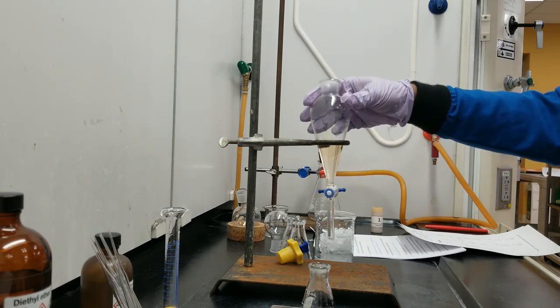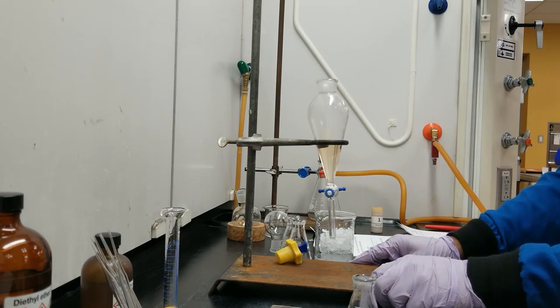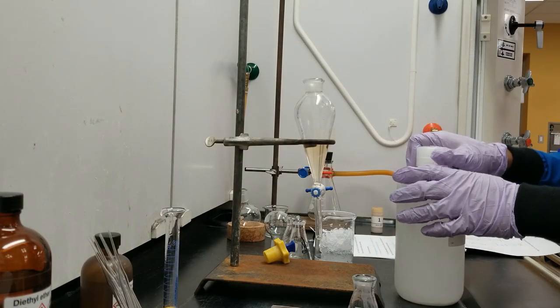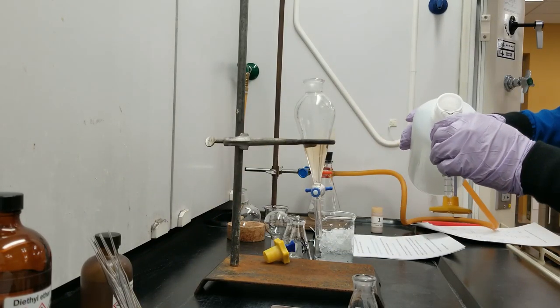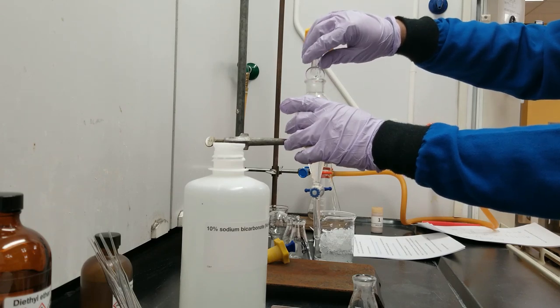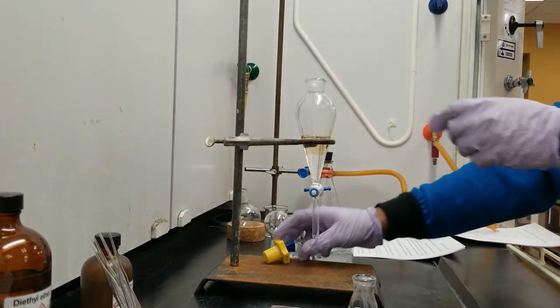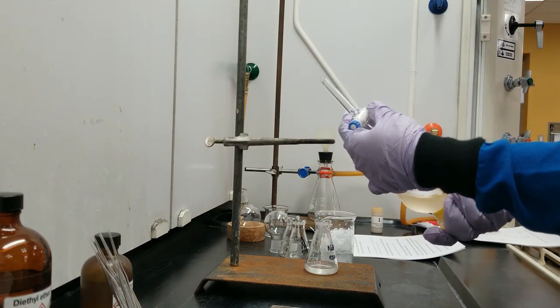This is the ether or organic layer of our solid mixture, which has two components still in it. One is the acetanilide and the second is 2-naphthol. We will treat our organic solution with 10% sodium bicarbonate again. And this time we'll be using 10 mL of the solution. So basically, we are repeating what we just did once again. This is the sodium bicarbonate solution. We cap it. We flip it. We shake it. And we drain.